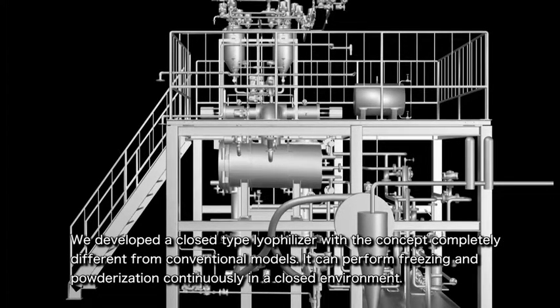Therefore, the space needed for an aseptic area can be significantly minimized and only requires enough aseptic space for powder filling and cap plugging operations.